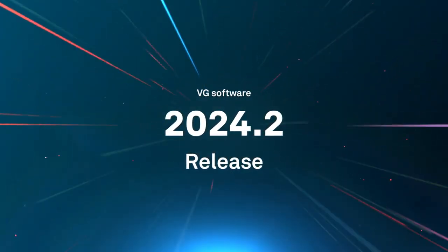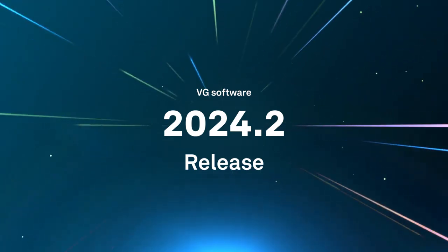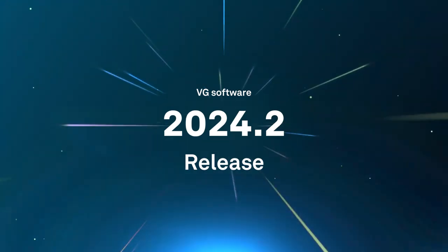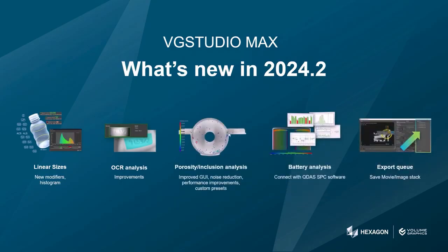Welcome to the future of CT data analysis and visualization with VGSTUDIO MAX. Our latest version, 2024.2, is here, and again, it comes with a long list of new features. So let's get right to it.